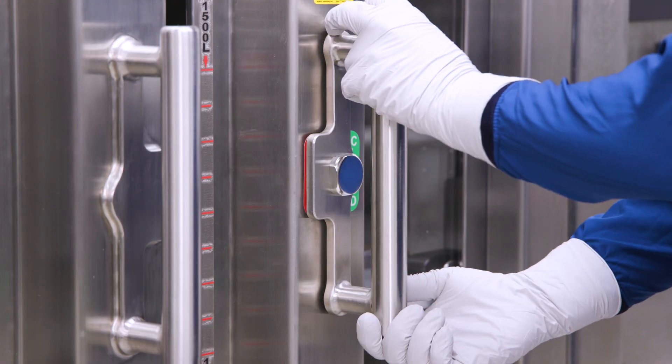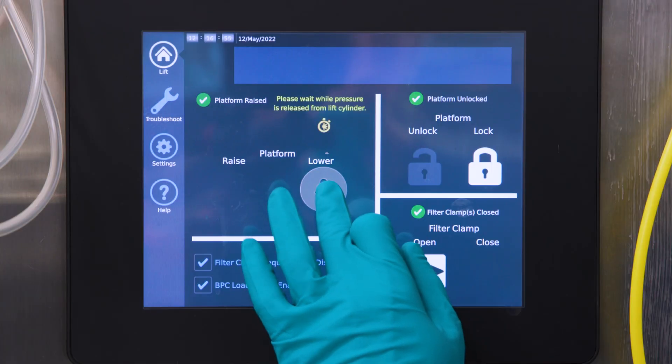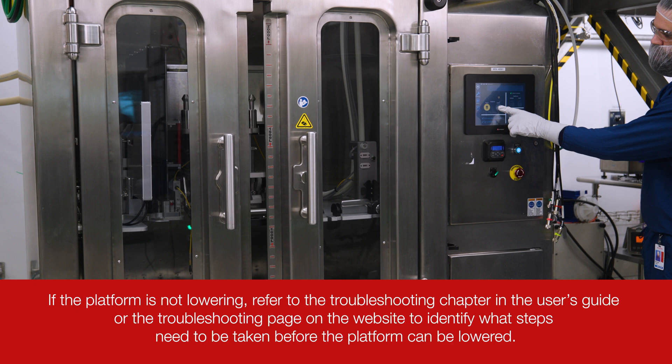Unlock the doors of your 3,000-liter or 5,000-liter DynaDrive Single-Use Bioreactor. Ensure that the platform is lowered. If it is not, use the HMI touchscreen to lower the platform to the stops found in the corners of the tank.